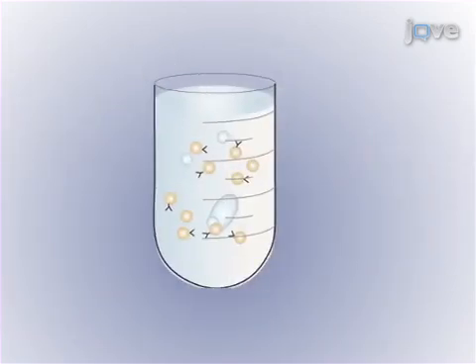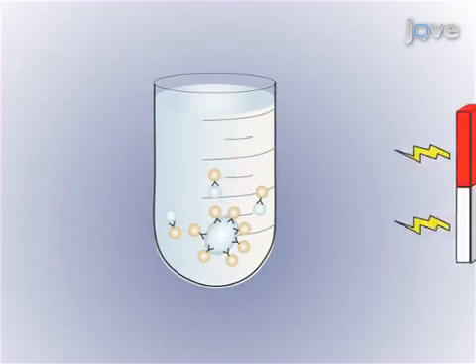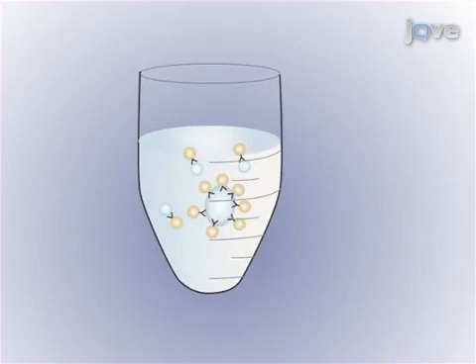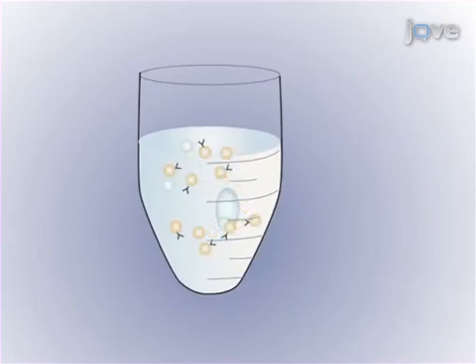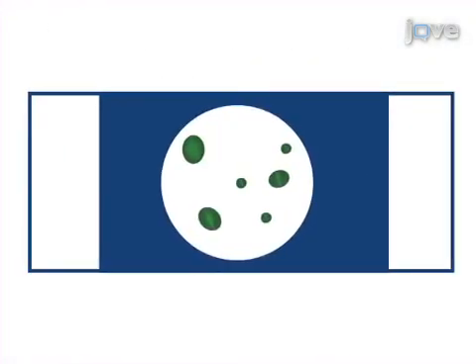Following a centrifugation step, immunomagnetic separation allows for selective separation of the parasites from the concentrated debris. Magnetic beads are detached from the parasites by heat dissociation and removed using a magnet. Cysts and oocysts are then placed on a slide, and the sample is stained for visualization by immunofluorescence microscopy.